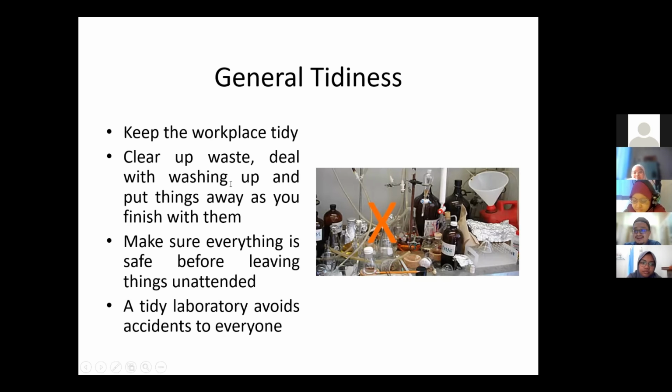So we need to clear up waste, deal with washing up and put things away as you finish with them. I want you to do this when you are in the lab. Make sure everything is safe before leaving things unattended. Even if you think you're just going away for 30 minutes for coffee, make sure things are safe. A tidy laboratory avoids accidents to everyone. Remember, those who enter are not only you and your friends, but also people like cleaners, very innocent people. They may not know what this and that are for. They may touch it.